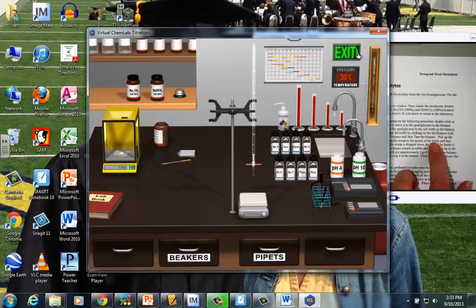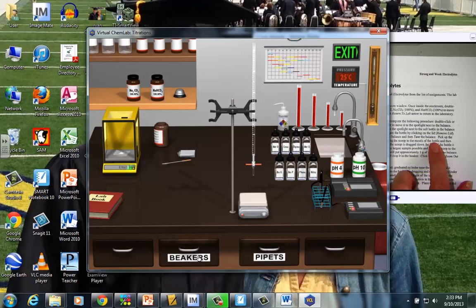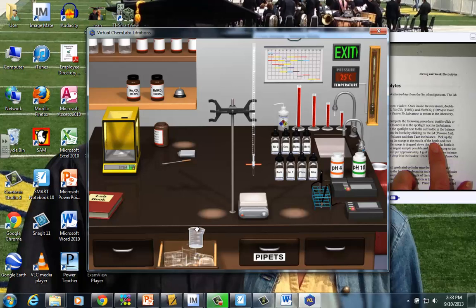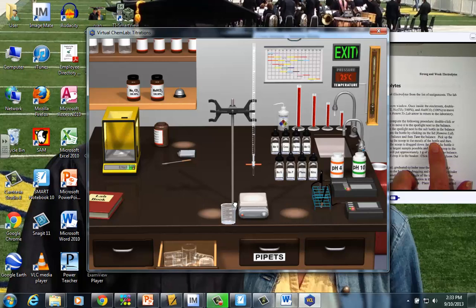I'll just zoom back out. See this drawer down here where it says beakers? We're going to click that drawer, grab one of those beakers, and you might as well put it directly up here on the stir buddy.